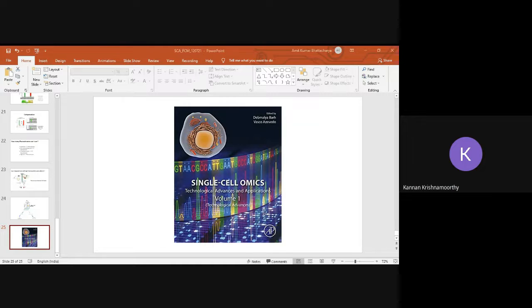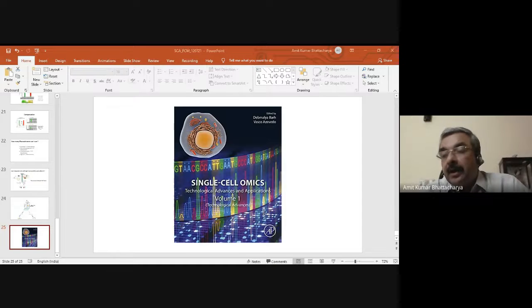Are there any other questions, children? Yes, sir. I have a question. Anushka asked. So you said that one of the limitations which contributes to background noise is autofluorescence, right? So how is it overcome then?